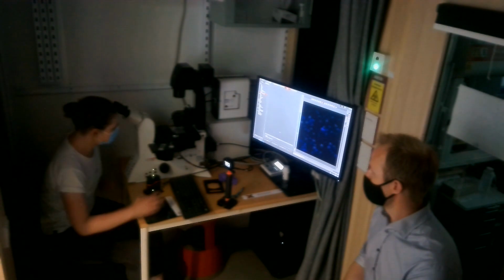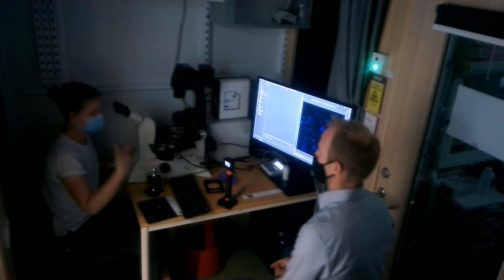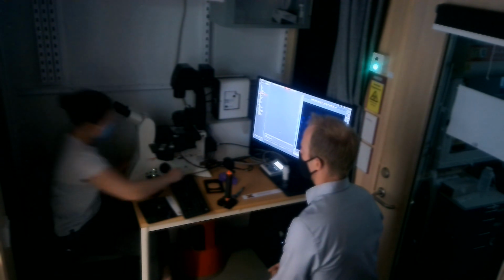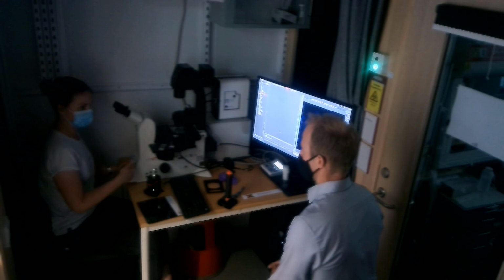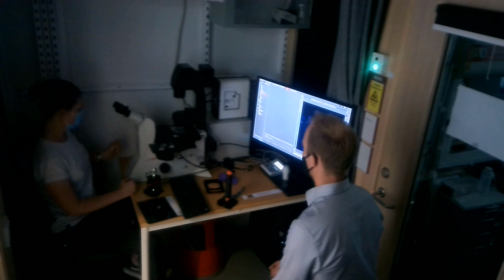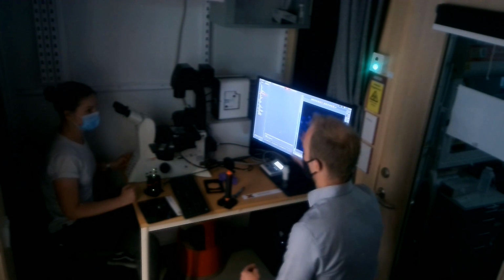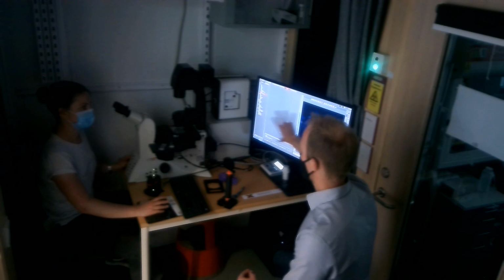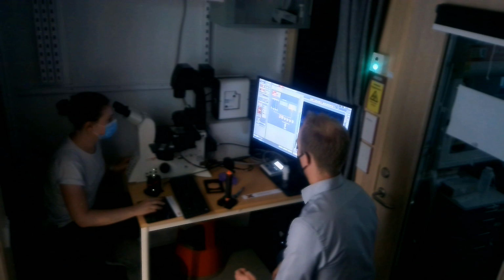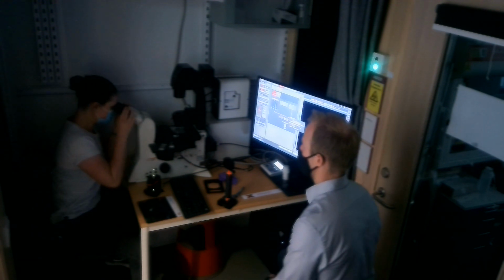Yes. Good. So if I wanted to check through the eyepiece or something, I would just change this one. Yes, push that in. And then I can control it via these things, basically. Yeah, but it depends on what you want to control. So what I would do, if you wanted to see the fluorescence now, to start the fluorescence, because right now the fluorescence lamp is connected with the software. So if you go live, you would have this, you don't have to bother with, and now you would have your light coming through there.